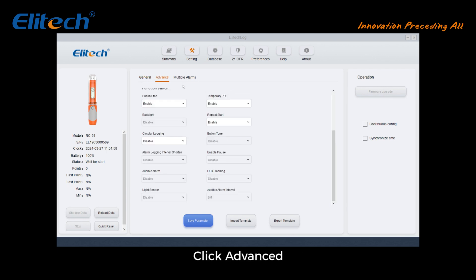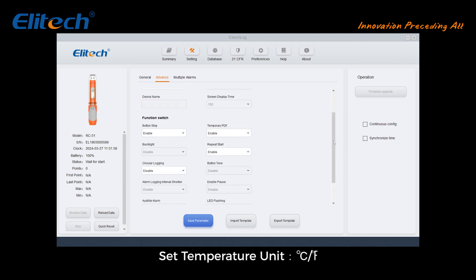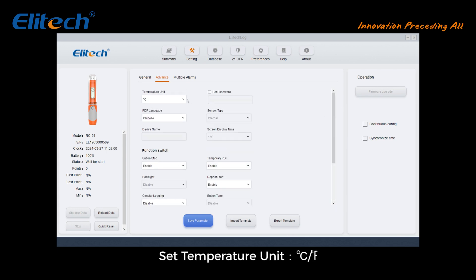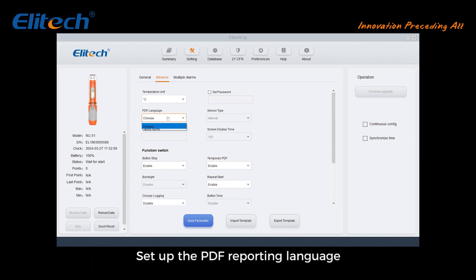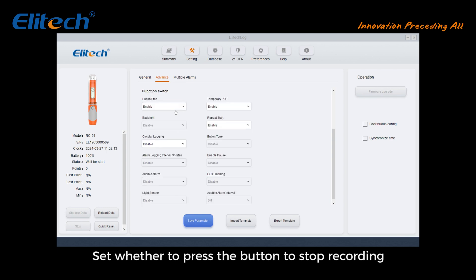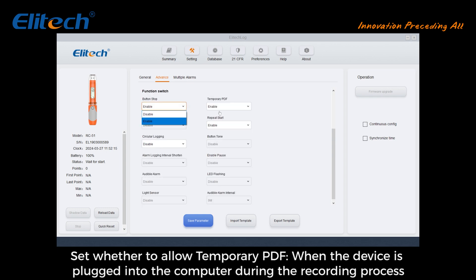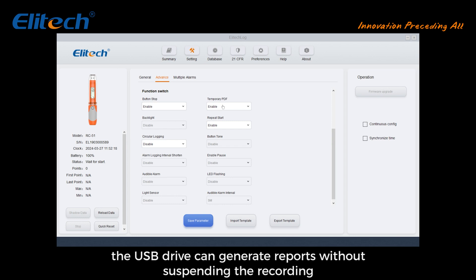Click Advanced to access additional settings. Set the temperature unit to degrees Celsius or degrees Fahrenheit. Set a password — after setting configuration parameters and data reports, you will need to enter the password to continue operations. Set the PDF reporting language, and set whether pressing the button can stop recording. Set whether to allow a temporary PDF when the device is plugged into the computer during recording — the USB drive can generate reports without suspending the recording.